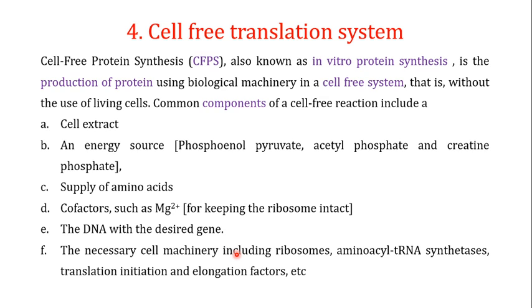The most important source available these days for the probes for the protein microarray is the cell-free translation system. The cell-free translation system, also known as cell-free protein synthesis, or CFPS for short, is also known as in vitro protein synthesis.